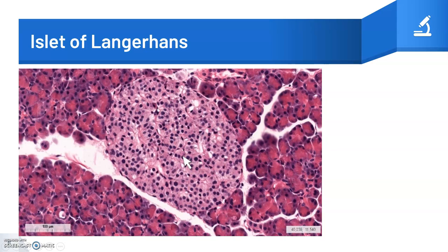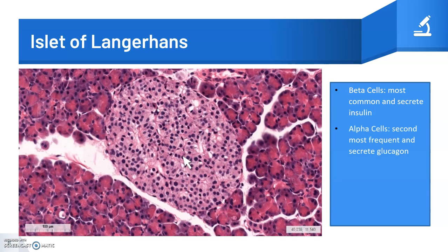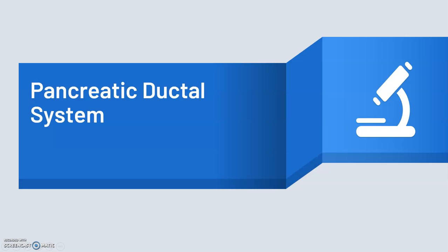Islets contain four major types of endocrine cells: beta cells, which are the most common and secrete insulin; alpha cells, which are the second most frequent and secrete glucagon; delta cells, which secrete somatostatin; and PP cells, which secrete pancreatic polypeptide. All these cells are indistinguishable in a hematoxylin and eosin stain.